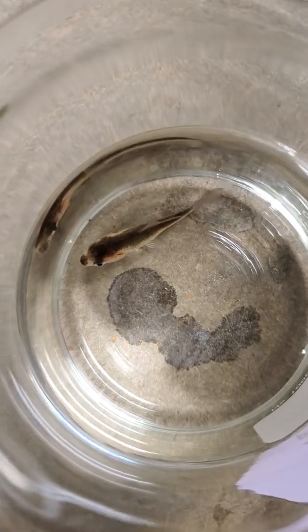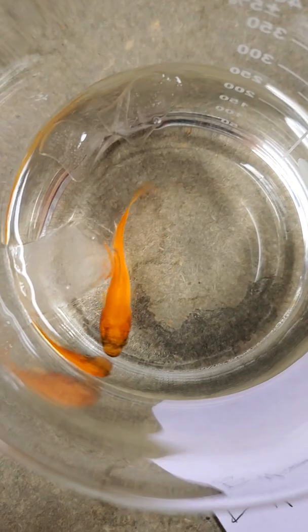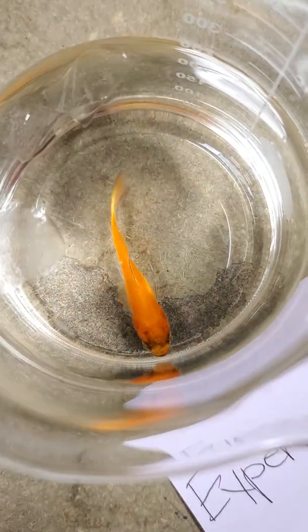And time. We're going to go back to our experimental goldfish. It is 11.5 degrees Celsius. And start.